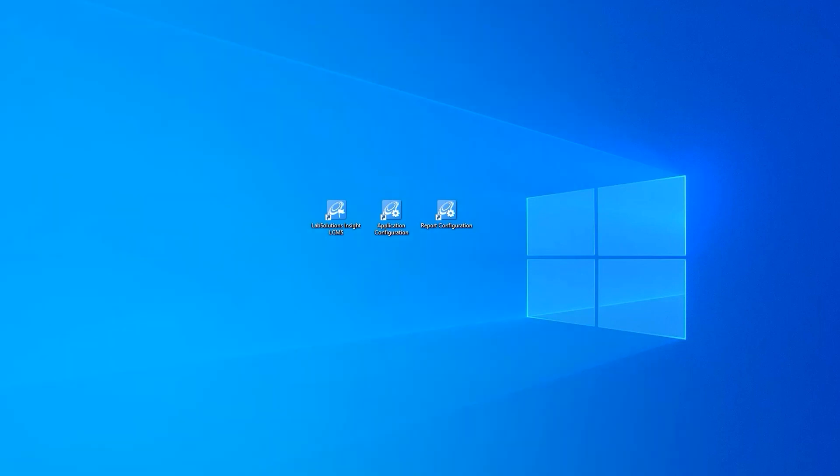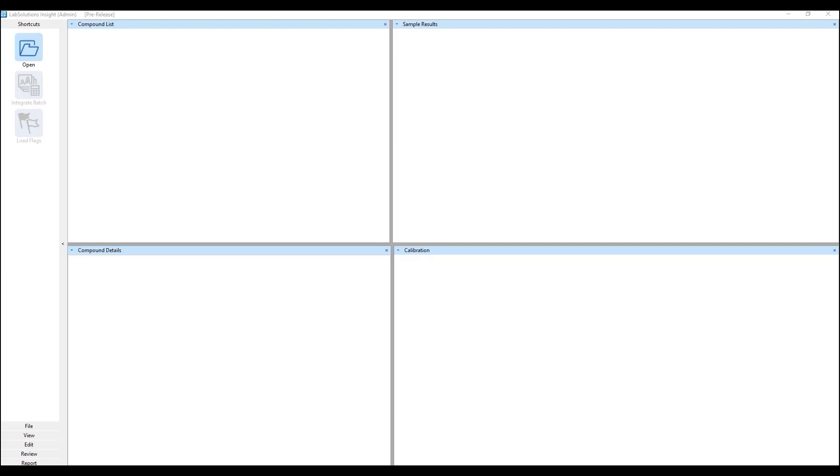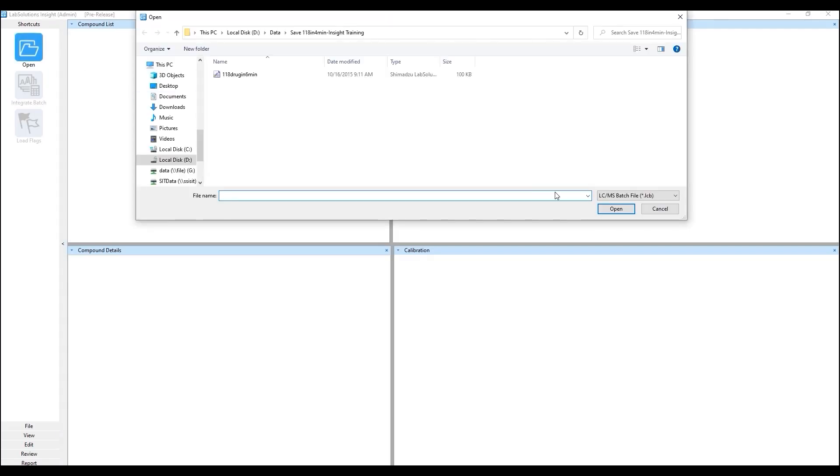Select Lab Solutions Insight, enter admin as the user ID and no password and hit enter. Open your data in Lab Solutions Insight.